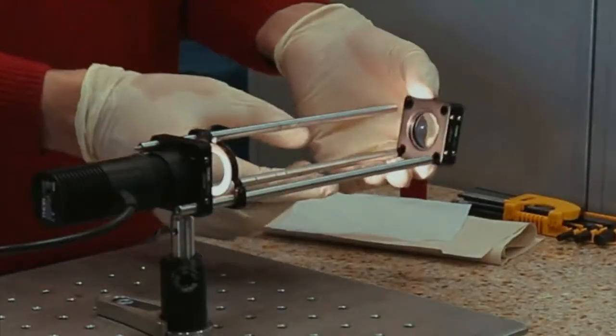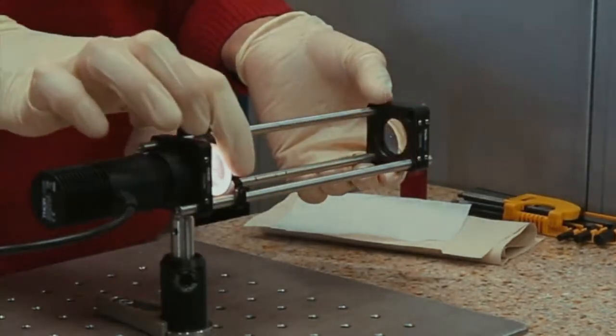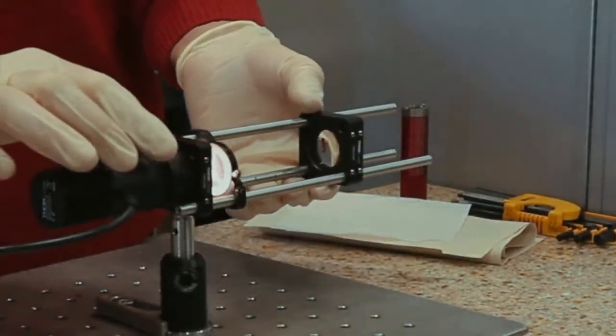Insert the cage plate in the cage rods. Make sure that the rounded face of the lens looks away from the LED light source.